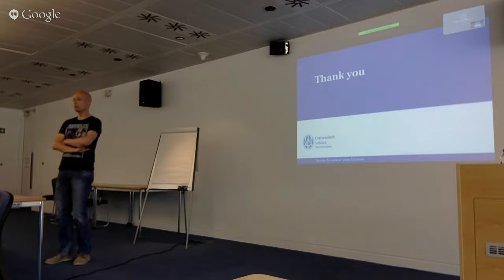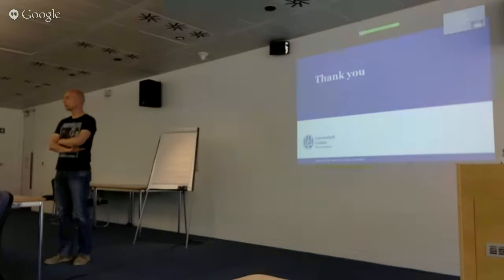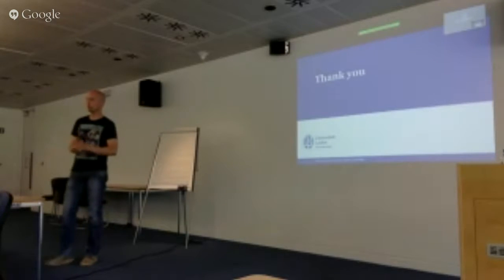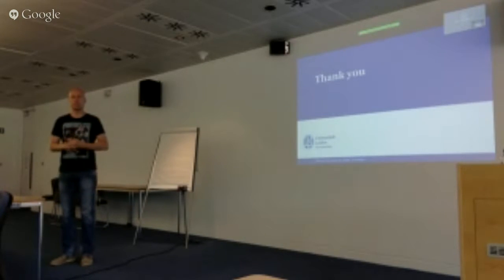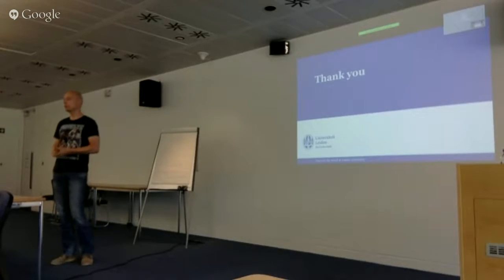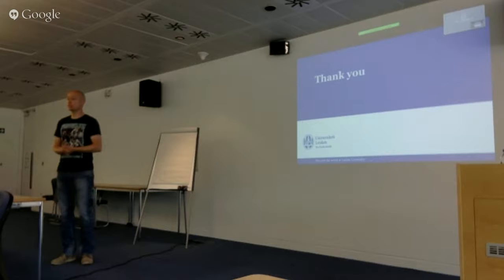This week I talked to the head of the lab and asked her what her main concern about data size and data sharing is. She said all the different formats and conversions also create copies of the same data eventually, so it would be better to just start sharing the raw data.